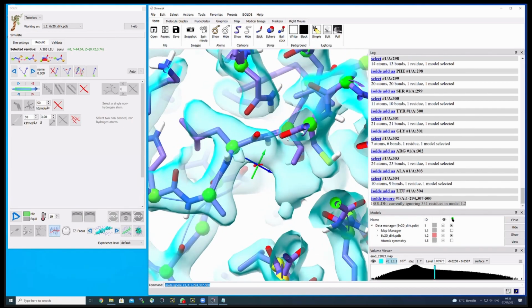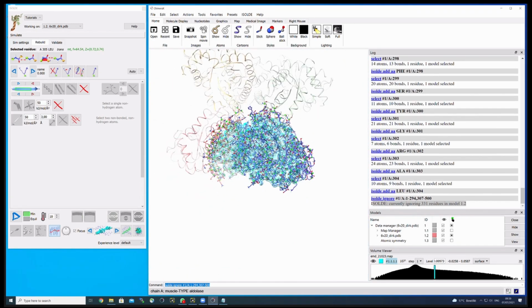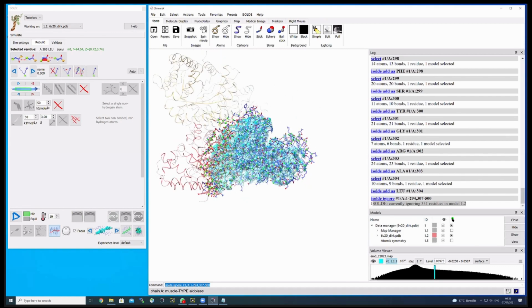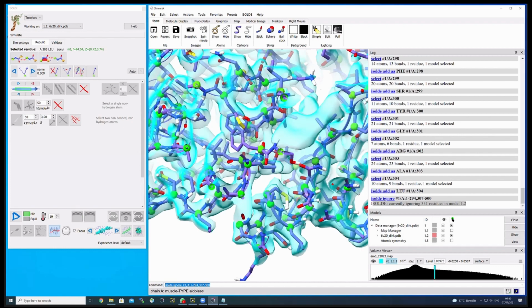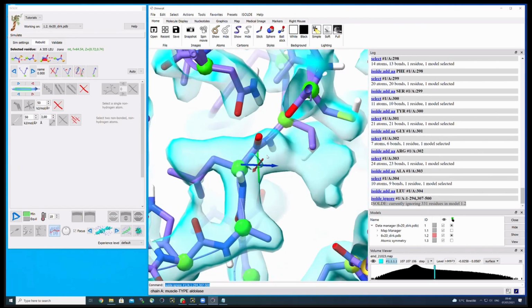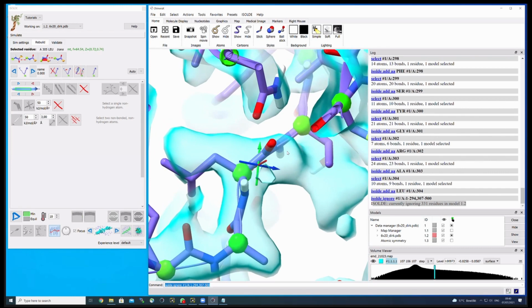And this we can do because this structure here actually contains 4 copies of the same molecule, and they are present already in one of the other copies or in all 3 of them. I'm not saying this is the typical flow through when you are building de novo into a map, but you could, for example, envision that you are modeling a monomer like ESCV or 24 subunits like we have in the type 3 secretion system, and you're pretty satisfied with your model and you assemble all the 24 subunits, let's say, by copy pasting.